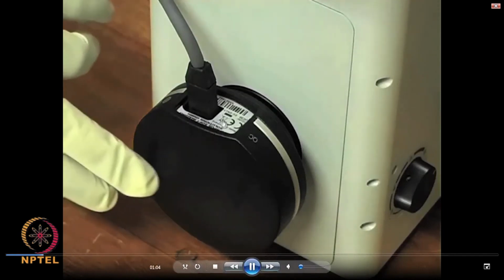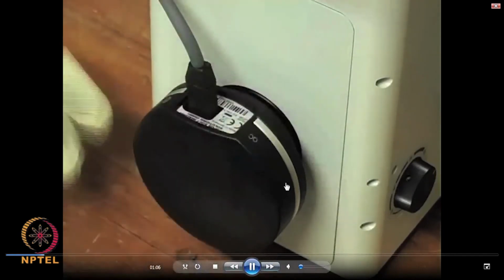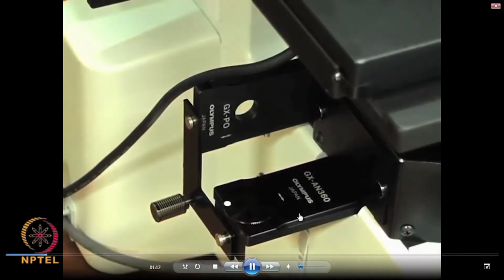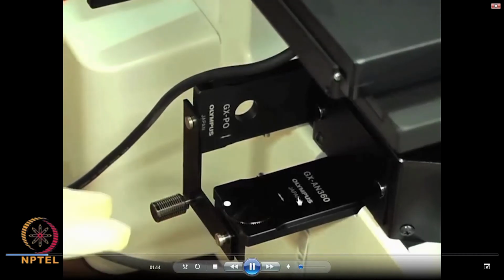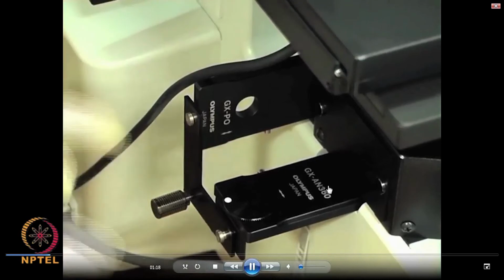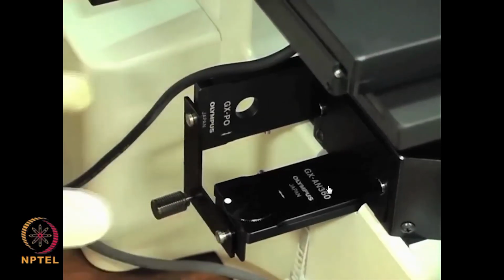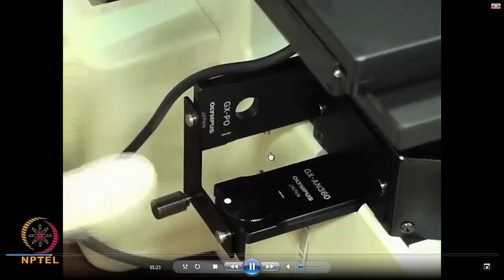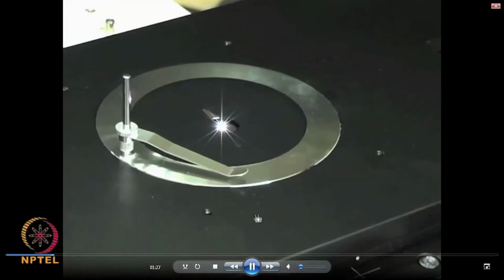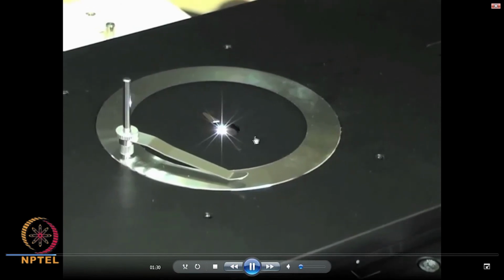This is a CCD camera attached to this microscope, and these are some of the polarizing lenses and apertures. I will talk about this a little later. It is one of the variants, as I mentioned, that we will use then. You see that the illumination is coming from the bottom, and then you keep your sample on this light.